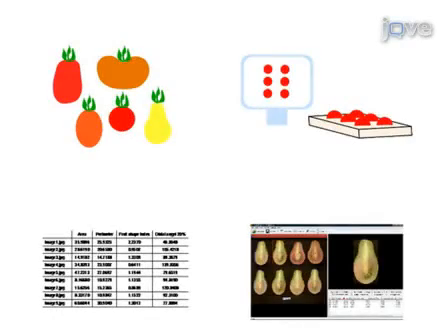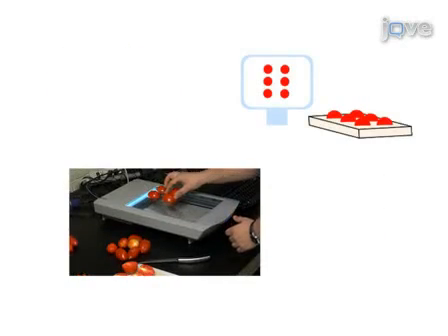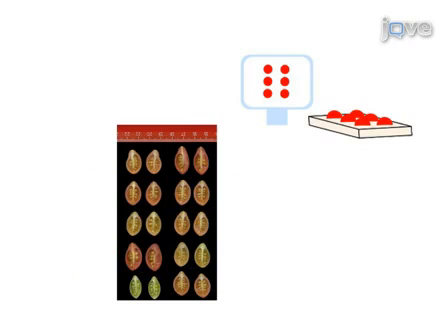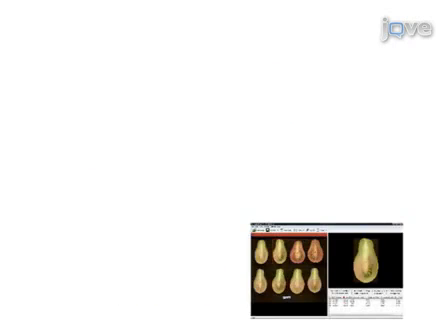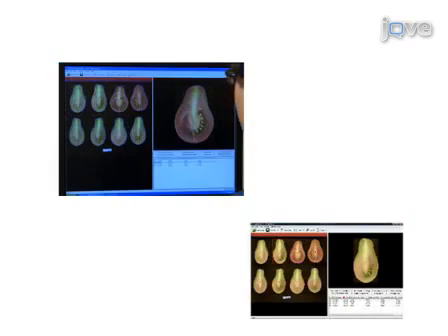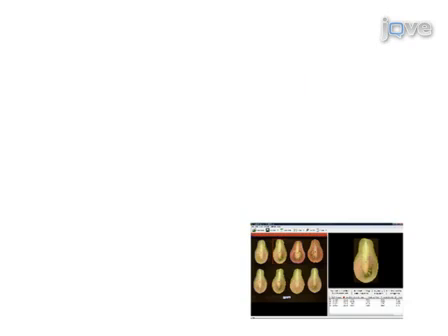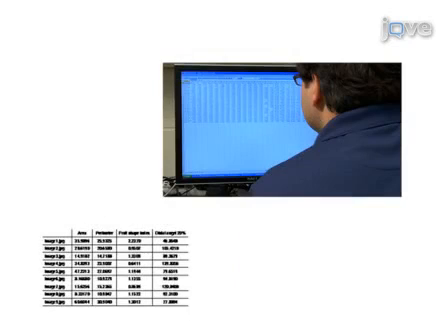To use Tomato Analyzer, tomato fruits are prepared and cut to collect digitized images. The fruit is placed on the scanner with the cut sides down and scanned to obtain a JPEG image. Next, the images are viewed and analyzed in the Tomato Analyzer software. All fruit shape measurements are calculated based on the fruit boundaries recognized by the software, whereas the color test module is designed to quantify the color parameters inside the boundaries. Finally, the data is exported to an Excel file in batch mode with more than 100 images at one time, or as individual images.